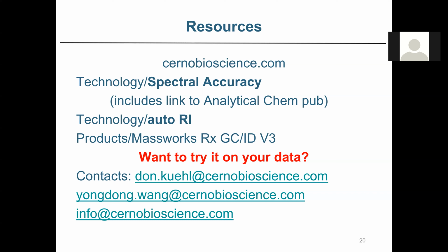So I think your question is whether we can do another level of deconvolution, for example, using forward and reverse search. That's a great idea, and we've actually looked at that. I don't feel confident right now that we can do it reliably and automatically. But as you saw, it's quite easy to do when you review, because you can look at the data, see that this particular peak was not well identified because it's colored, and go in there and go through that mental process to figure it out. So it's not automated. Hopefully one day it could be.